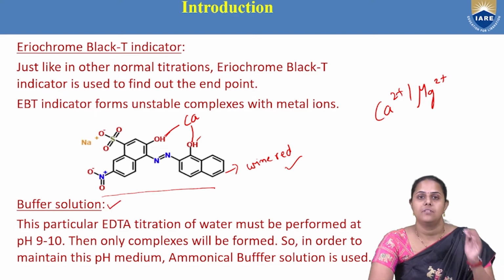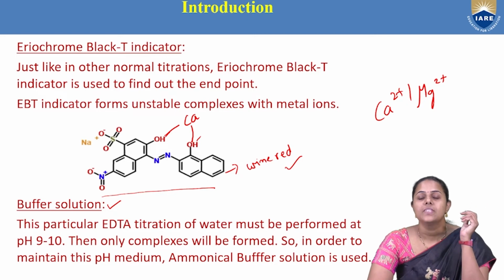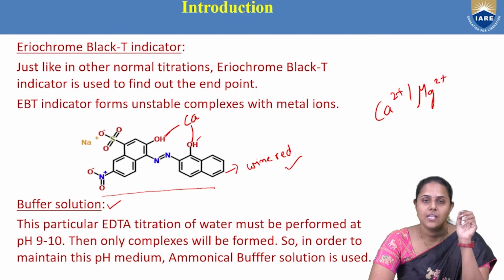The third solution is the buffer solution. What is the role of a buffer? Buffers are the solutions which will resist the change in pH. If I add a buffer, that will resist the change in pH.